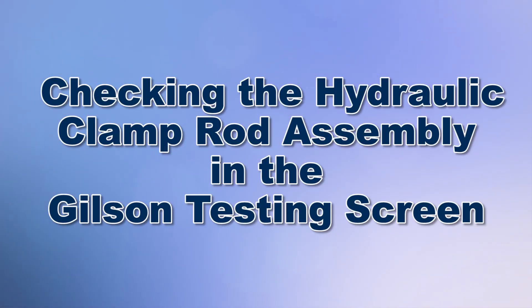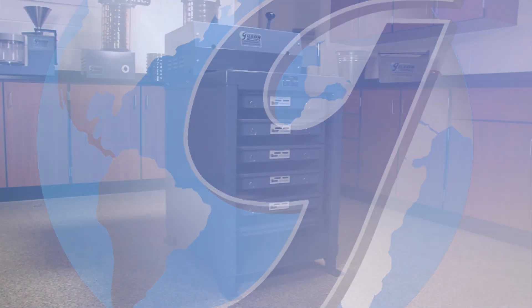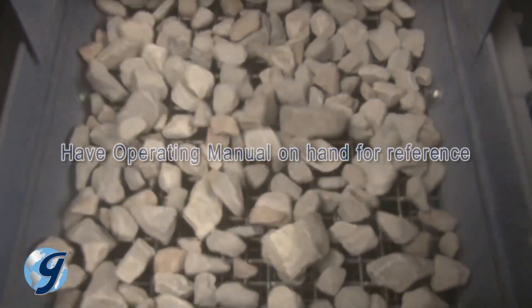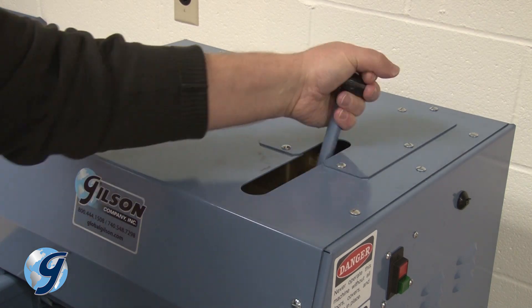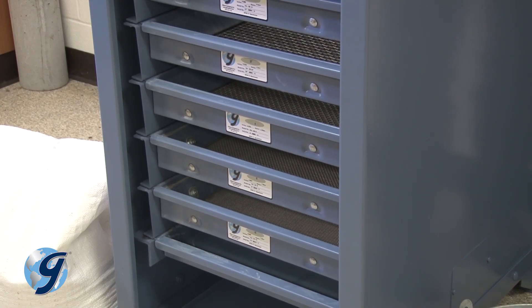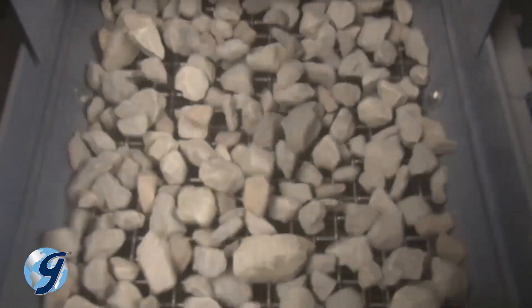Today we're going to inspect the hydraulic clamp rod assembly in your Gilson testing screen. The Gilson testing screens are rugged and tough machines that will provide years of service if installed and maintained correctly. With Gilson testing screens with hydraulic clamping, the hydraulic clamp rods fit through a series of guide bearings and draw the separator parts together to clamp the screen trays in place for efficient screening operation.